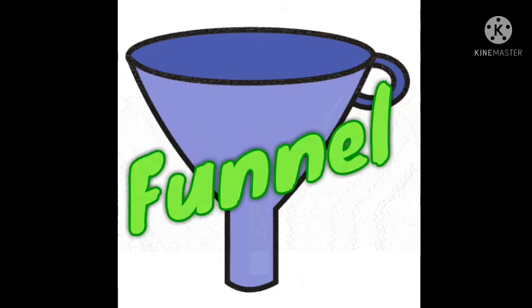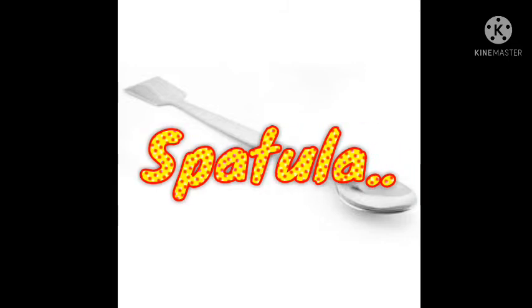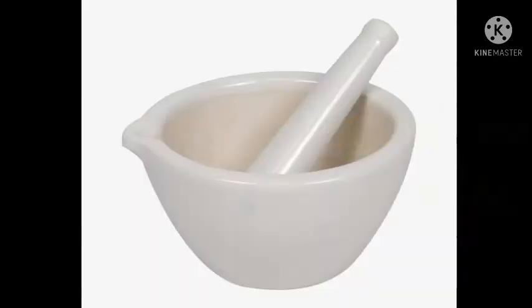The funnel is used to channel liquids into containers with a small opening. The next material is known as the spatula. It is used to mix, spread, and lift materials or substances during an experiment.